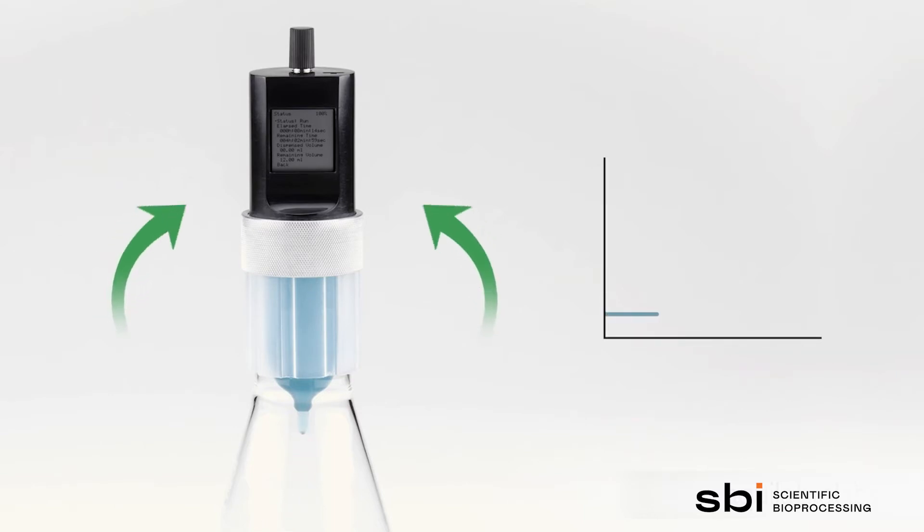In order to dispense a defined amount of liquid from the cartridge, the drive pumps air back into the cartridge. After this dispense step, the drive rebuilds negative pressure to keep the remaining liquid in the cartridge.